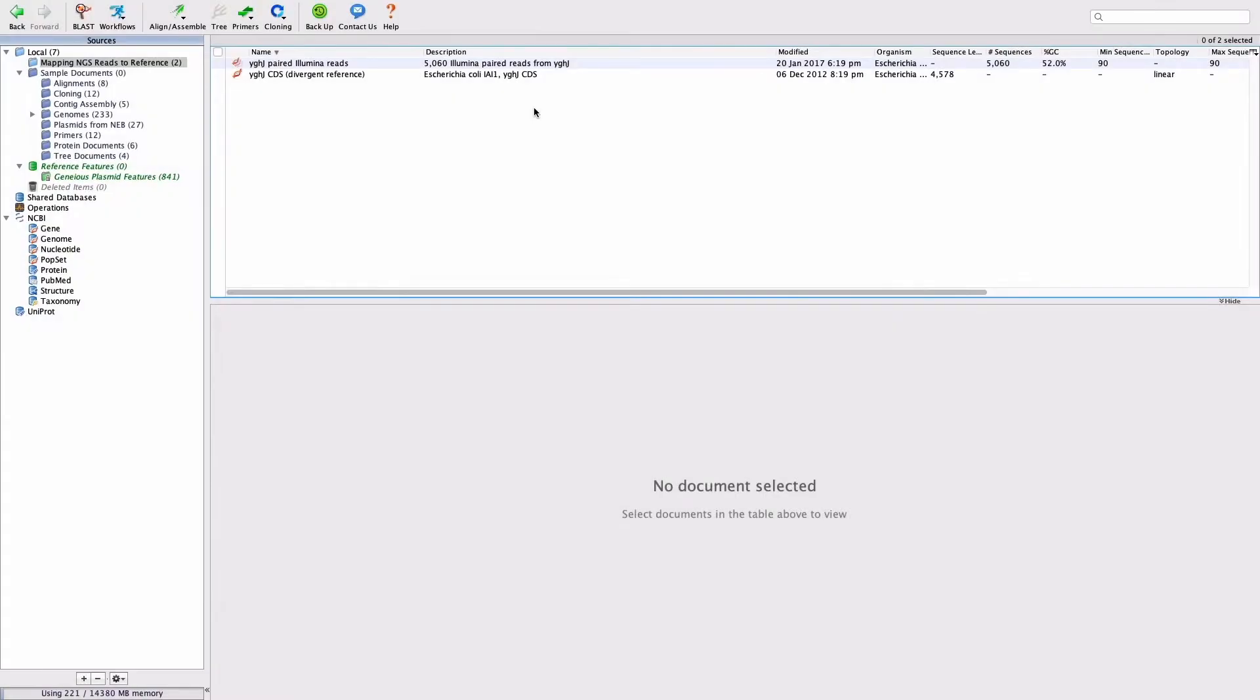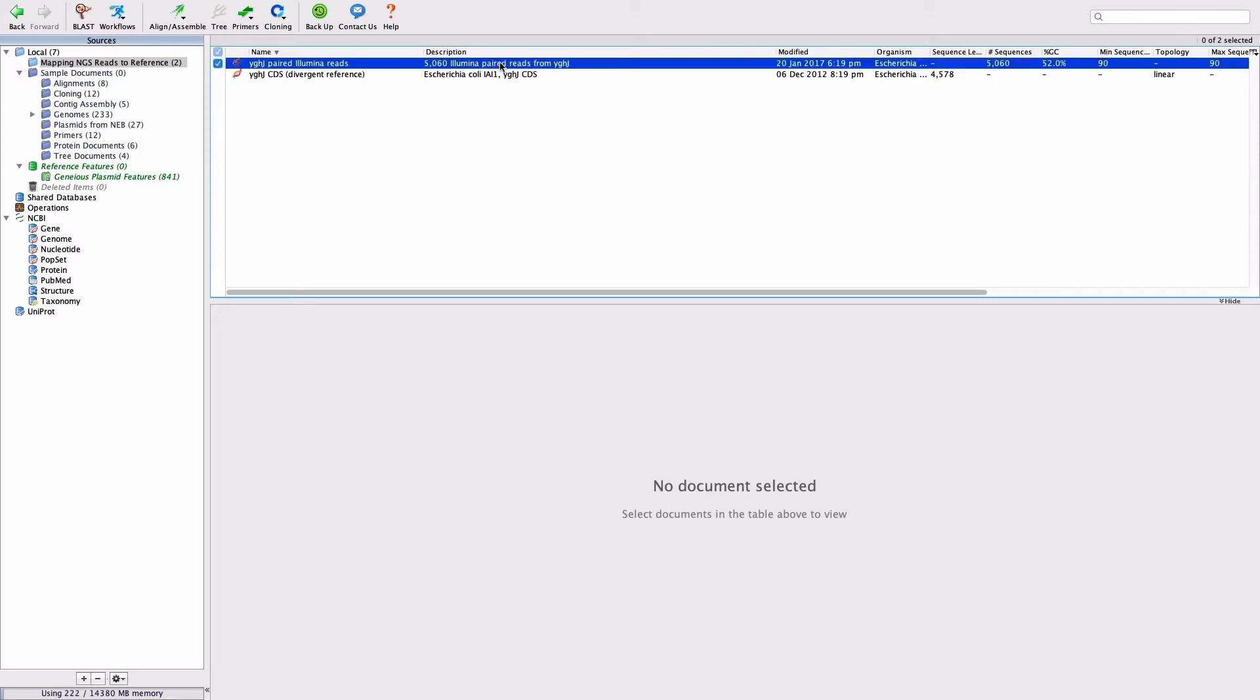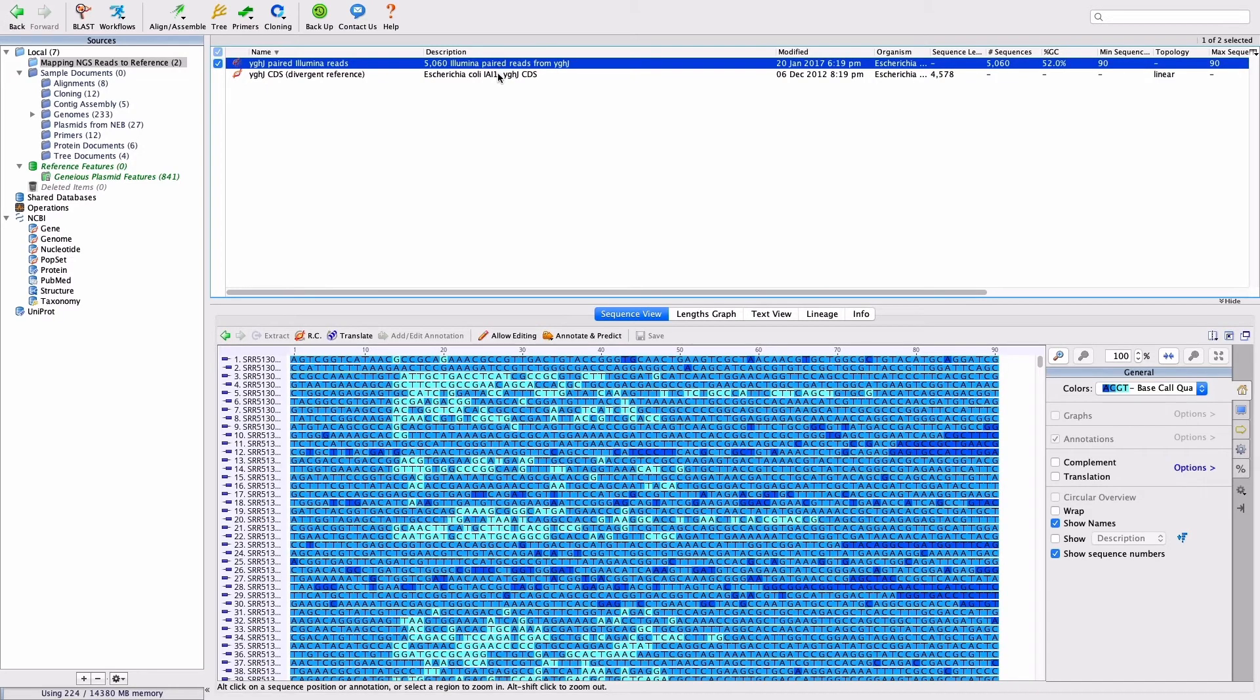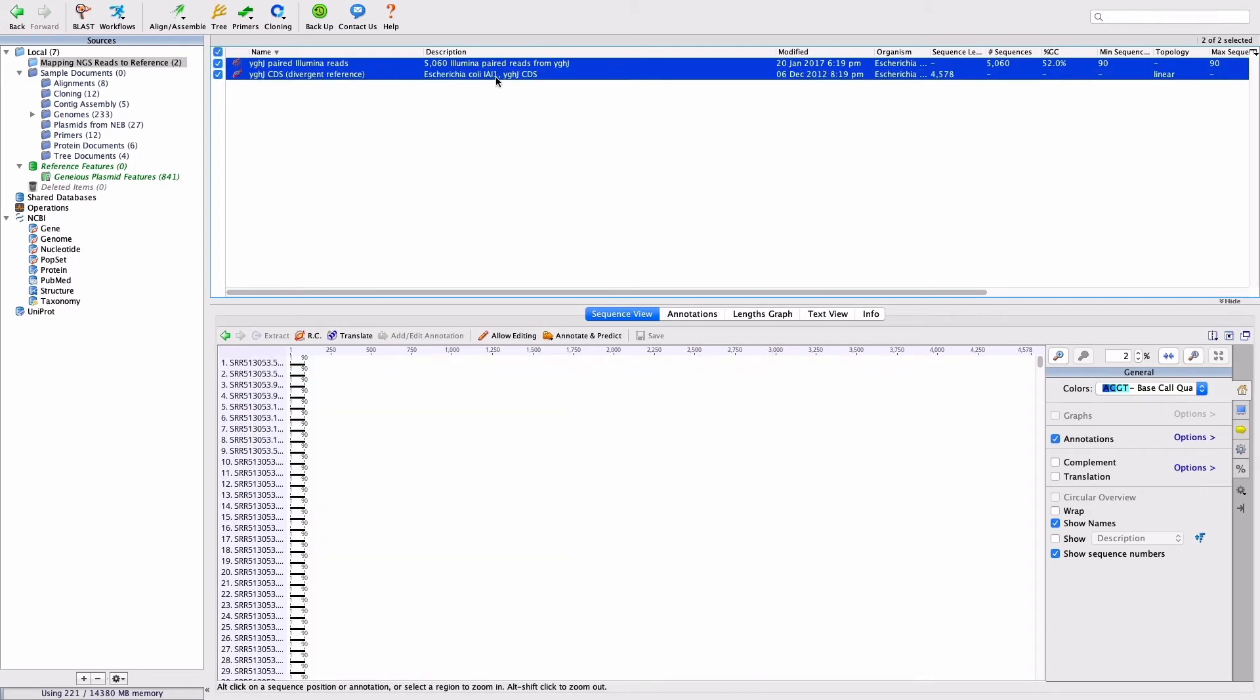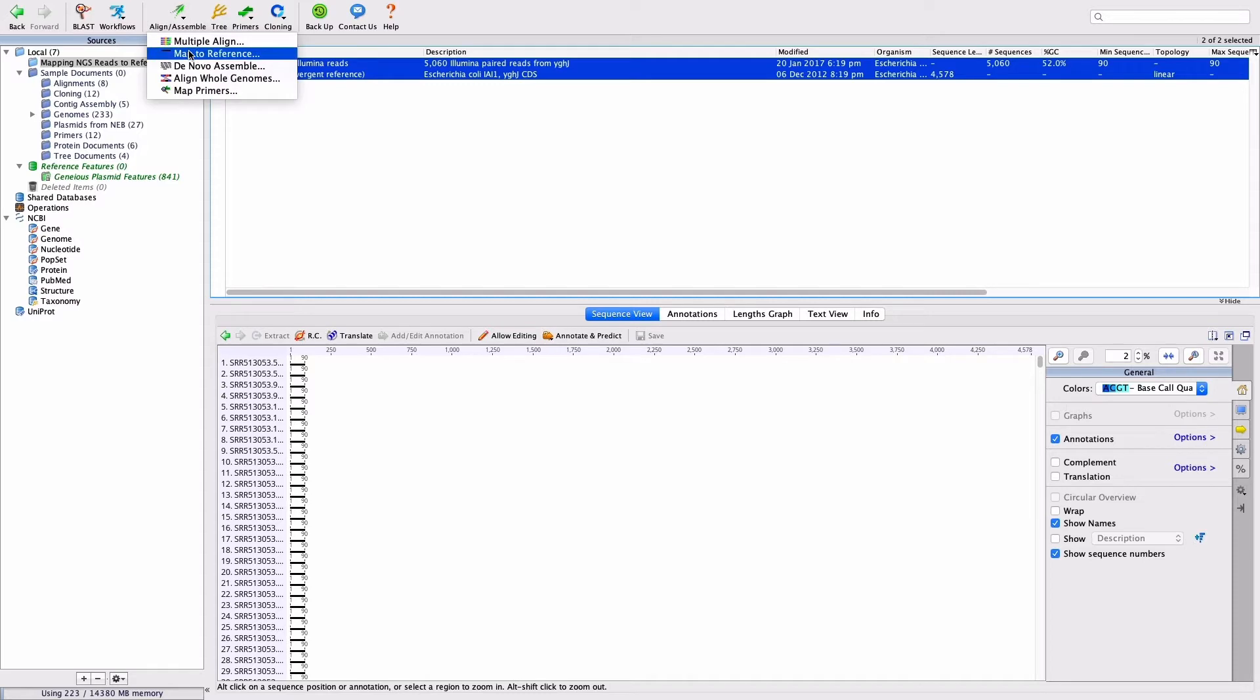We are working with a dataset of trimmed Illumina sequence reads, which map to a single gene in the E. coli genome. Select the file of trimmed reads and the reference sequence and click Align Assemble and Map to Reference.